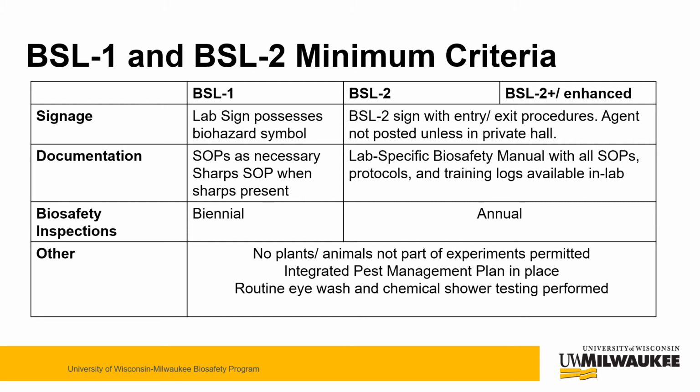It is also important to remember that no matter the biosafety level of containment, no plants or animals that are not part of the experiments are allowed. An integrated pest management plan must be in place, and you must have a well-maintained eye wash and chemical shower available.